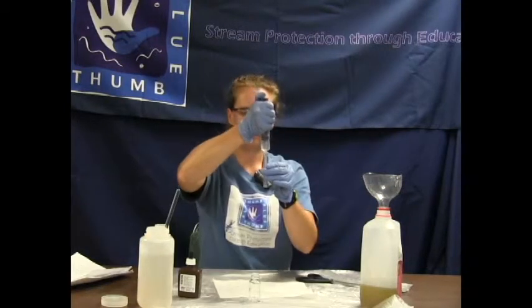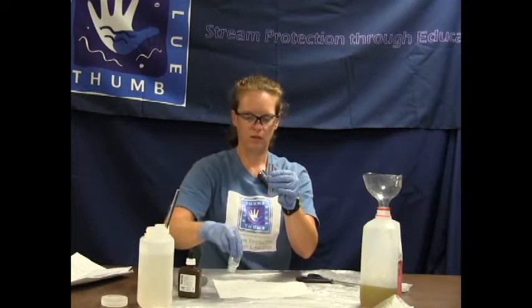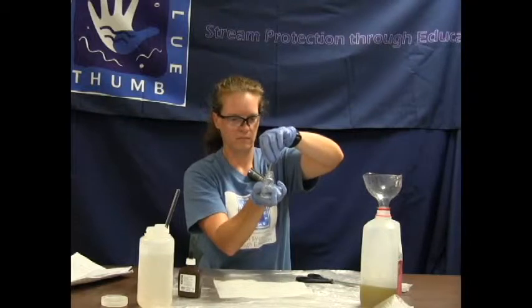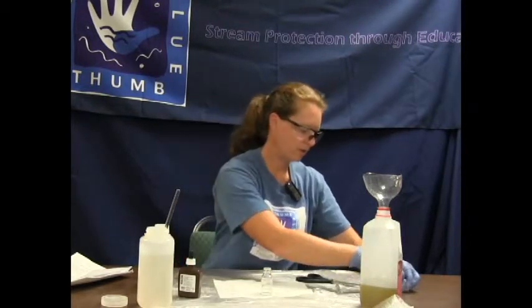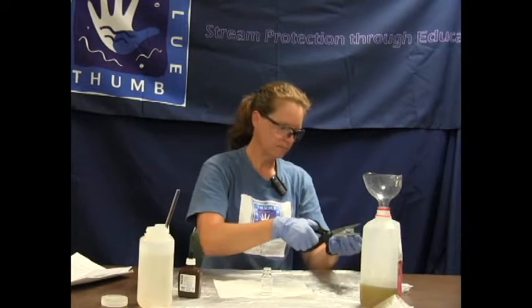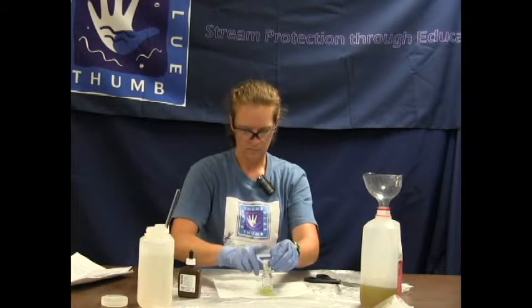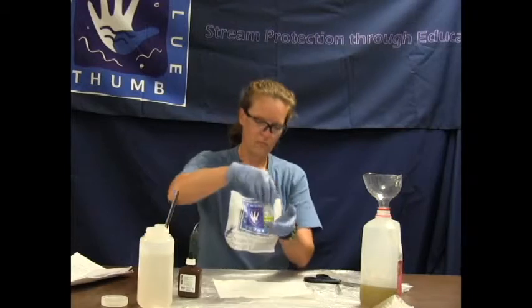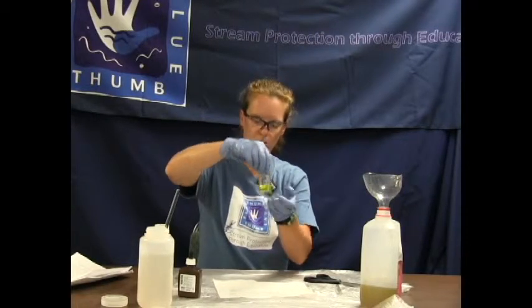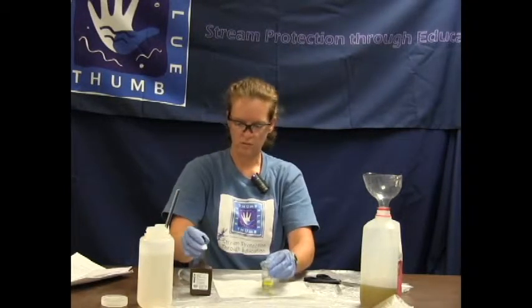We will fill it so we have the reverse meniscus — the big bubble on top — and get all of that into the square mixing bottle. We will add our chloride 2 powder packet to our bottle, agitate and swirl until the powder reagent is dissolved. It starts out as yellow, so we are starting off good.